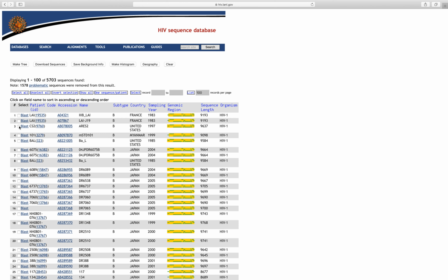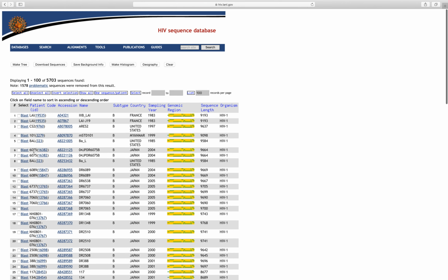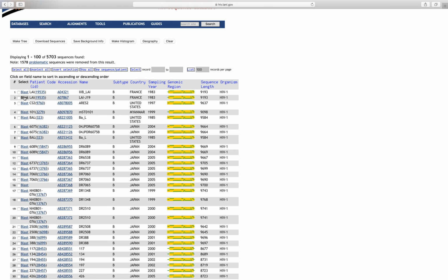So just going through what the different columns are, this output allows you to select specific sequences as you're looking through them. Because there are so many, that may not necessarily be useful for these applications, but it allows you to select them, and then you can look at the sequences later. What you can do then is blast that sequence against other types of sequences, and that'll basically be using an NCBI BLAST type situation. And this requires another discussion for sure.